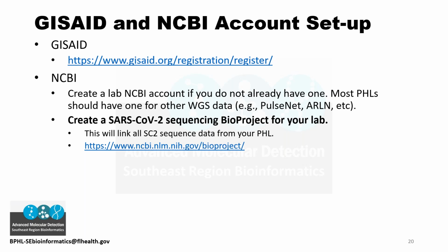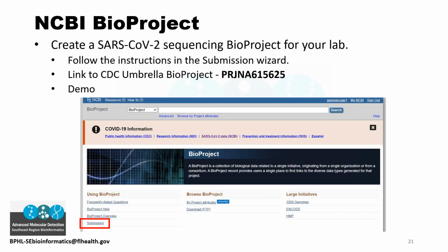In case you have not registered your BioProject, do that first before you do any SARS-CoV-2 submissions. And if you haven't yet, you should. You have to link it to different information. Go ahead and do it. Okay, we're going to go through those.